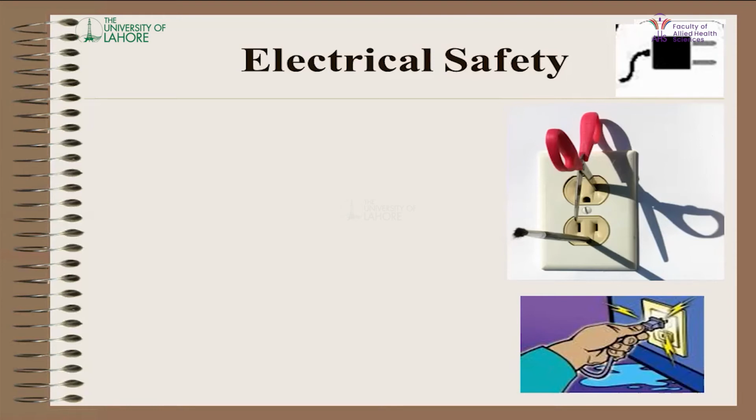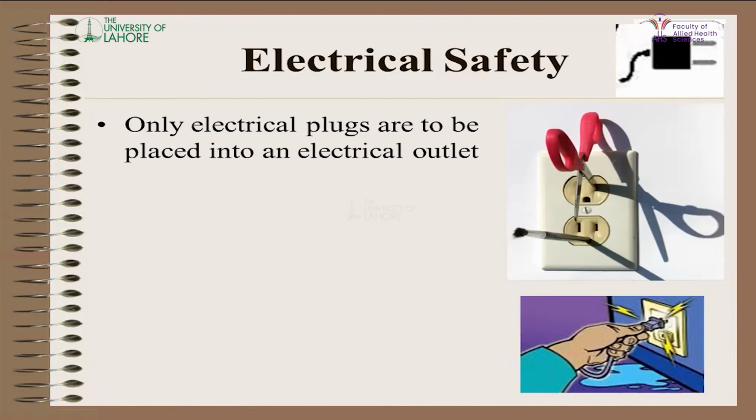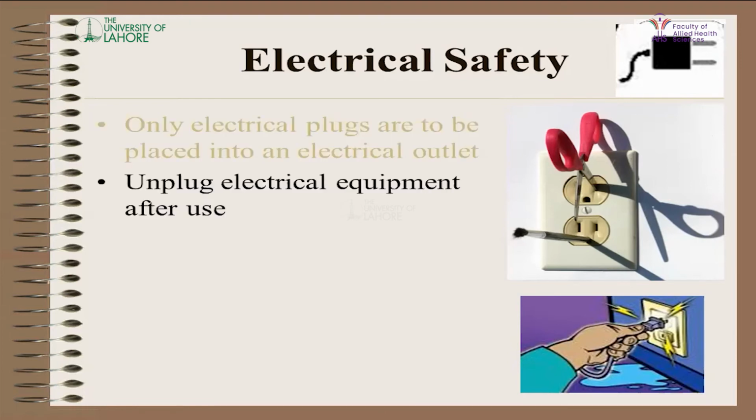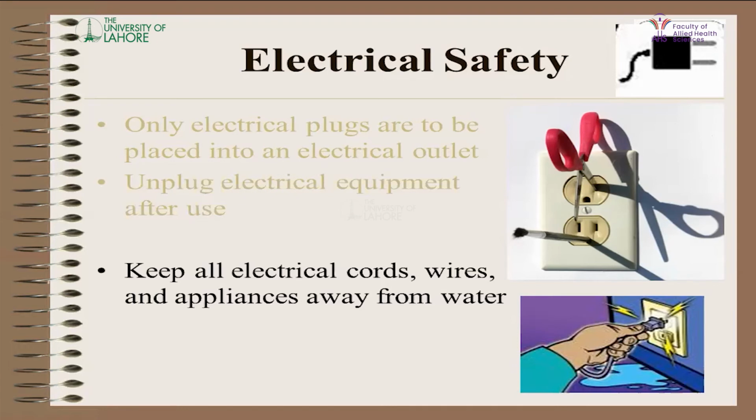Next important point would be electrical safety, and electrical safety, as you know, instruments are working on electrical supplies and electricity. You have to be very careful when using electrical plugs. Only electrical plugs are to be placed on electrical outlets. Do not try to put anything else inside the plugs. Unplug electrical equipment after use, and also protect the plugs from water in case of calamities.